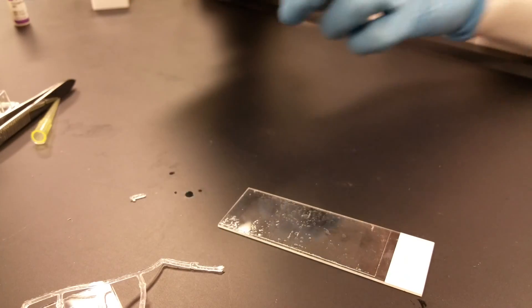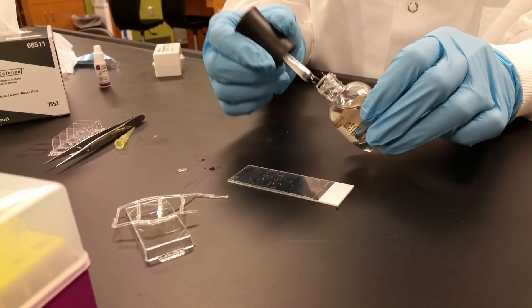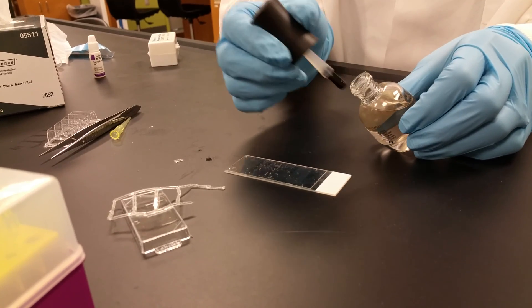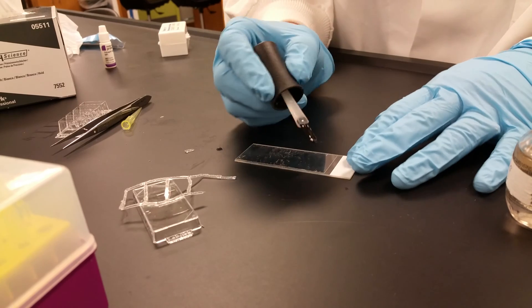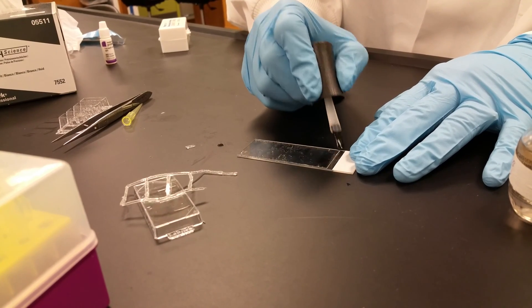The very last step is to seal the coverslip onto the slide. You do that with nail polish. You just need a tiny amount of nail polish, so wipe off the edge of the brush on the mouth of the nail polish so you don't get big dribbles, and then just make a small line right on the edge of the coverslip.